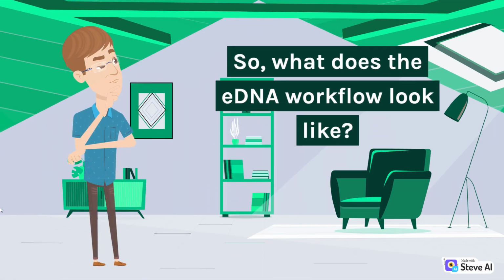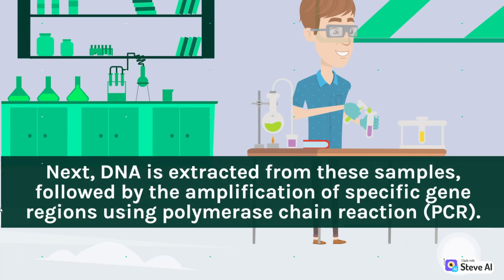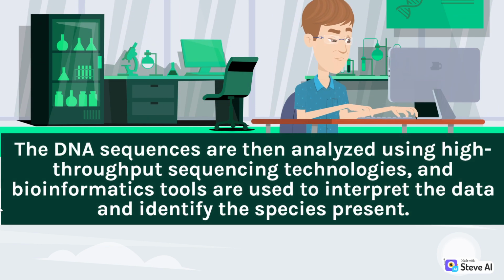So, what does the eDNA workflow look like? First, samples such as water, soil, or air are collected from the environment. Next, DNA is extracted from these samples, followed by the amplification of specific gene regions using polymerase chain reaction, PCR. The DNA sequences are then analyzed using high-throughput sequencing technologies, and bioinformatics tools are used to interpret the data and identify the species present.